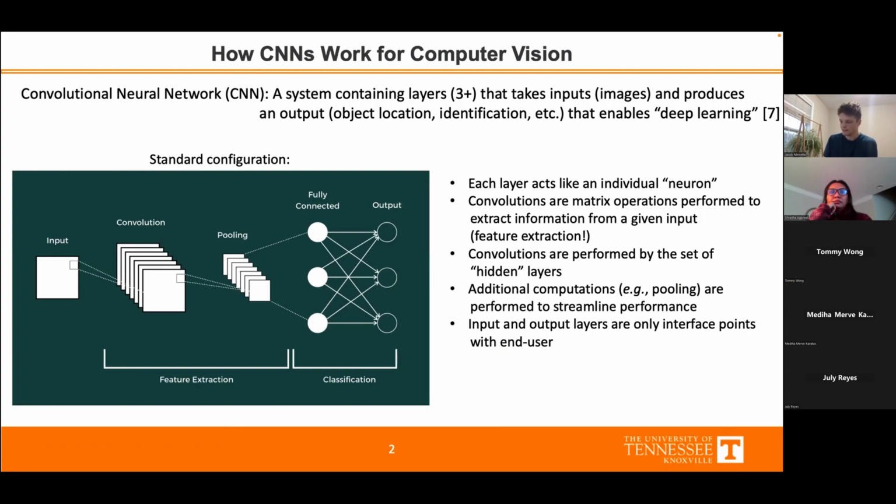So for actual image files, you would present your image, and the computer would be able to analyze it pixel by pixel in order to do a series of different mathematical operations or convolutions, and to extract relevant output information.